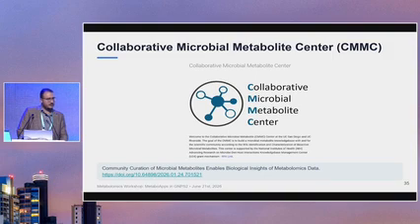So basically, to gather as much information as possible on microbial data, and to do any sort of studies for gut microbiome, for microbial cultures, to look at the metabolites, to look at the correlation, to look at information between gut microbiome and other types of studies. And the center is supported by the NIH Microbiome Diet Host Interactions Management Center.